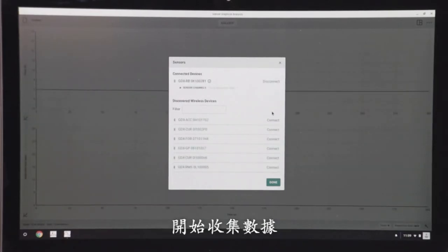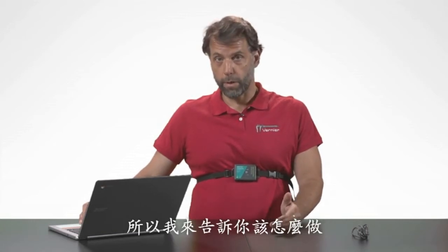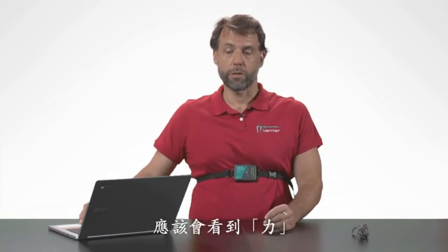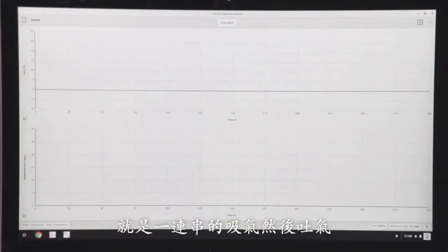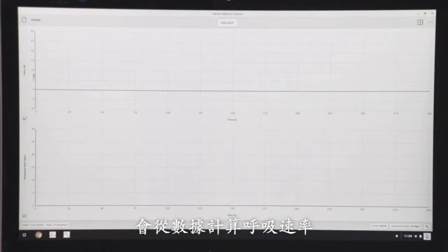Now I'm ready to collect data. I'm not going to be able to talk when I collect data because I have to breathe. What I'm going to do is just breathe normally, and you should see where it says force a series of inhalations and exhalations. Then down below where it says respiration rate, it'll calculate the respiration rate from that data.